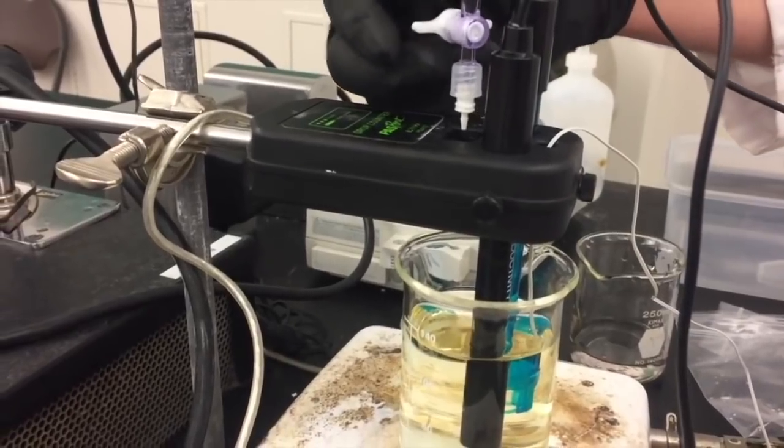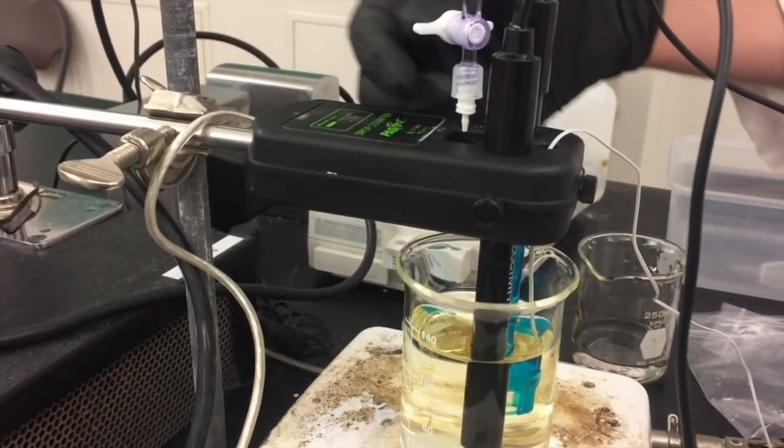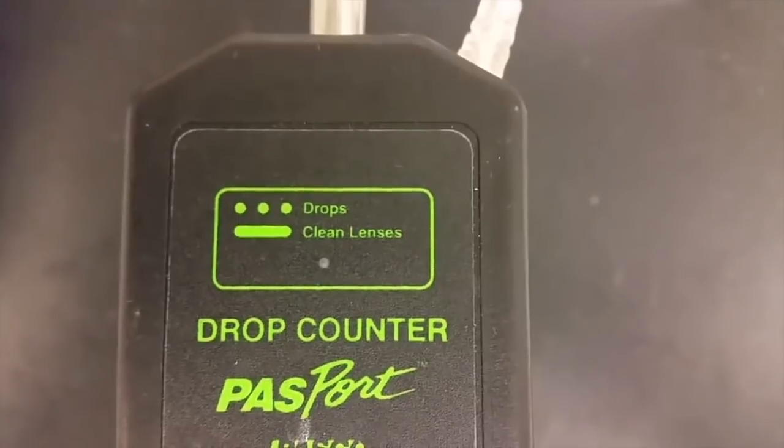Next you'll want to check the position of the drop dispenser above the drop counter. You want to make sure that the tip on the drop dispenser is centered directly above the opening in the middle of the drop counter and that it's about a centimeter above the opening. It shouldn't be too high because then the drops can splash and if it's too low and sitting inside the drop counter then the drops don't get counted.